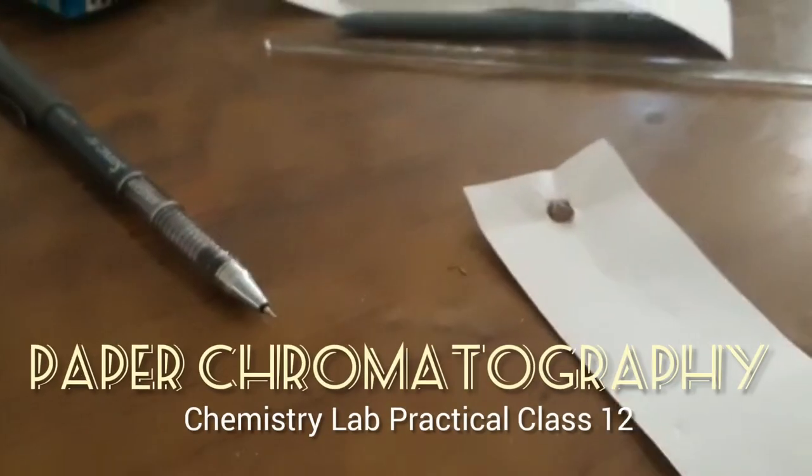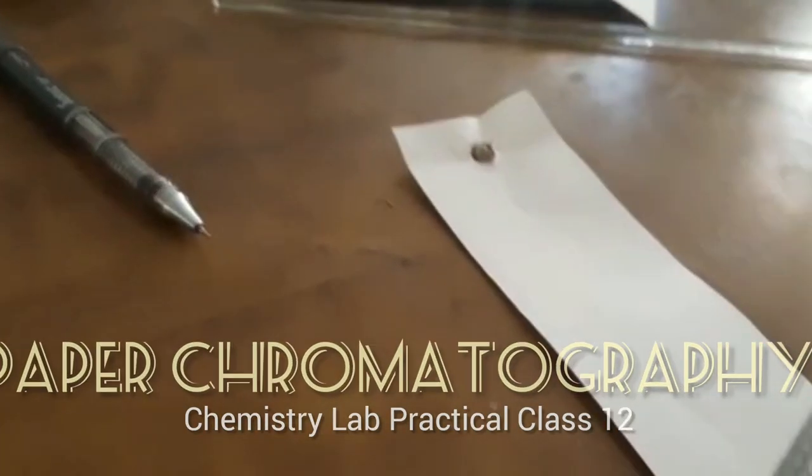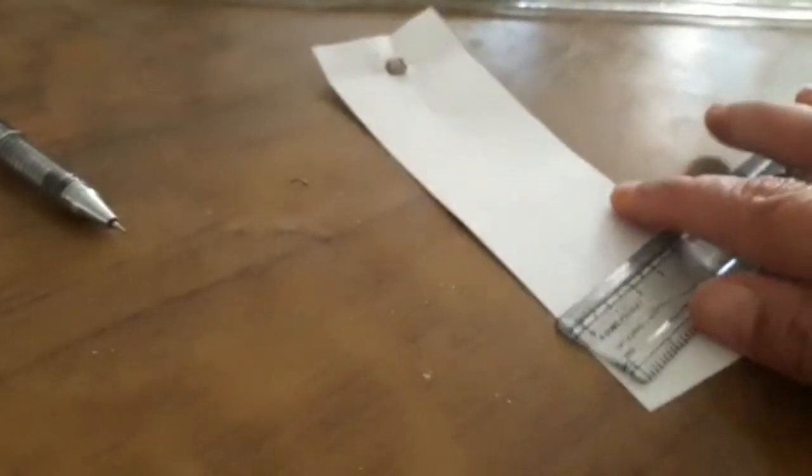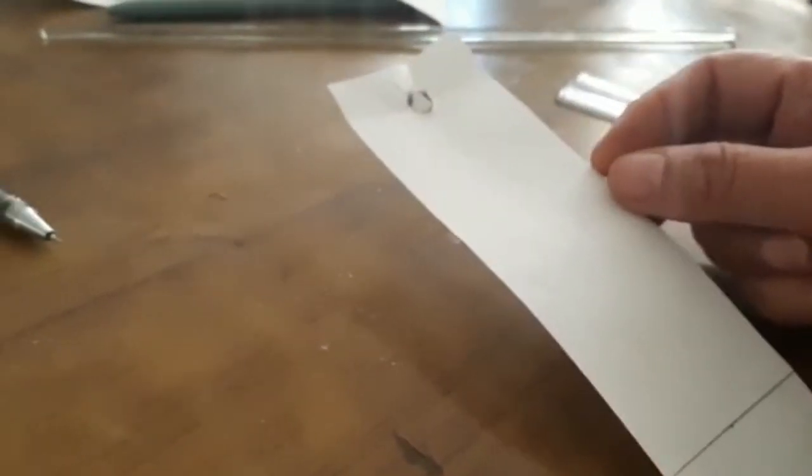Today we are going to do an experiment on paper chromatography. This is another requirement of your CBSE board syllabus practical. For paper chromatography, I've taken this paper strip — this is filter paper, Whatman filter paper number one.